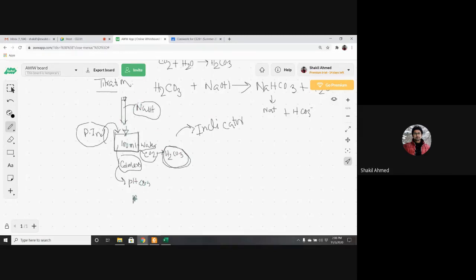For example, your pH was here, maybe 7, whatever it is. So you start adding sodium hydroxide drop by drop. And you're adding what? Base. So will the pH rise or reduce? Tell me. Reduce, sir. You're adding base, so it's a rise. So from 7, it will rise to 8.3.